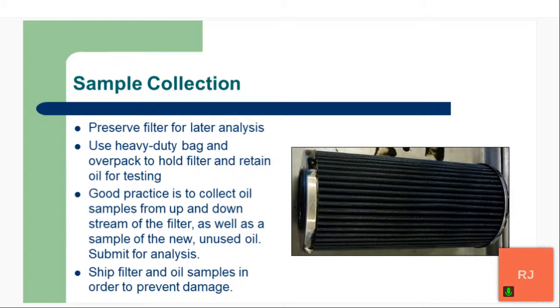And like we mentioned, that we have an overpack. And then when we get later in the presentation, you'll see the filter analysis kit that we have, and that's going to protect our filter and the samples as they get returned to the laboratory.